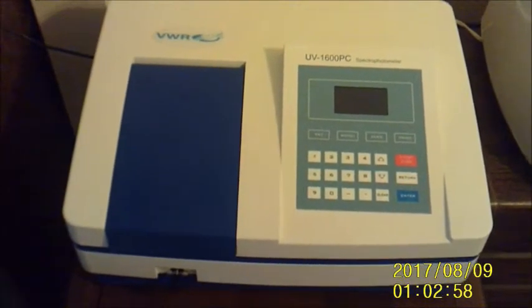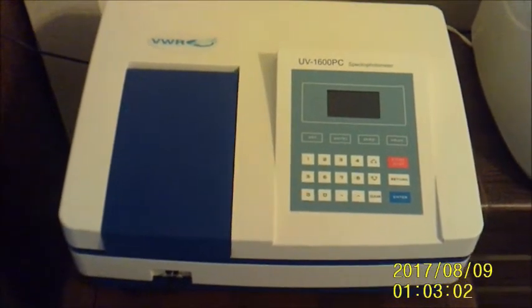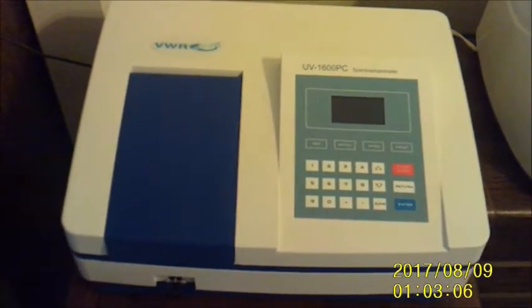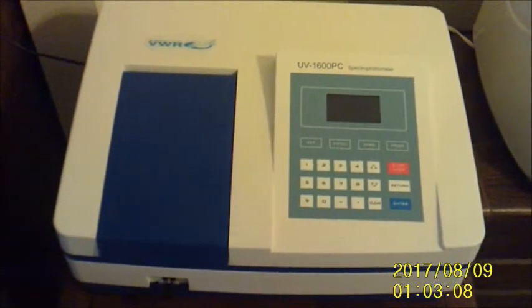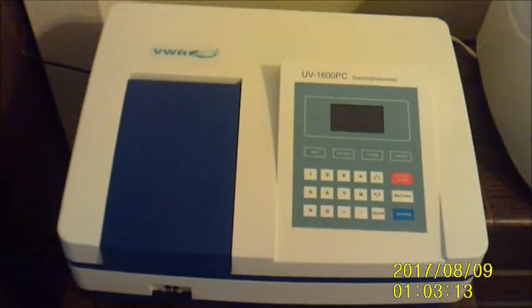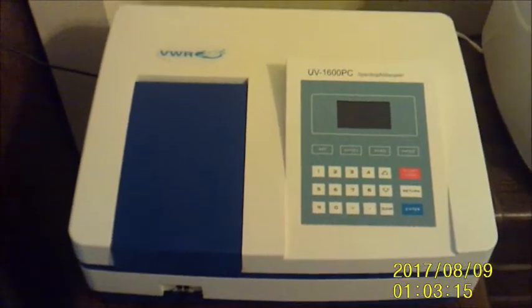This is the VWR1600PC UV-Visible Spectrophotometer. The wavelength band is from 190 to 1100 nanometers. It can feed data directly from the device into your computer via the M-Wave Spectrophotometer software program, although this is something that I am still trying to work out, actually.